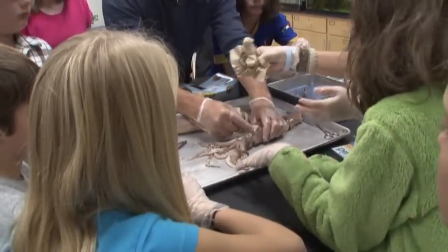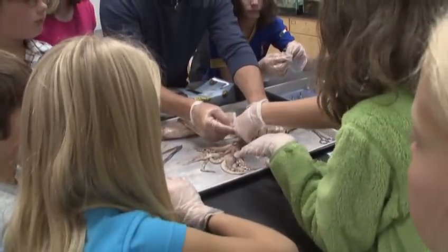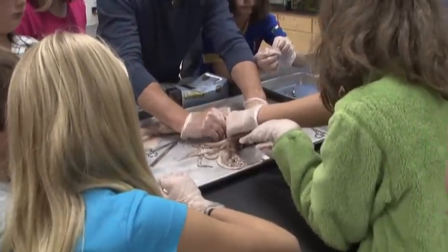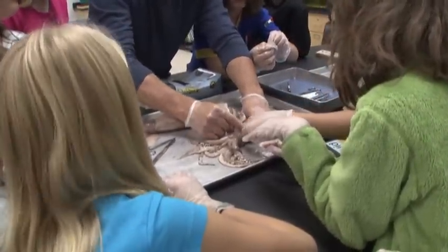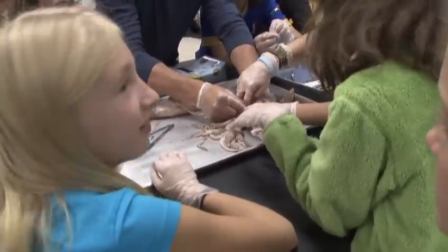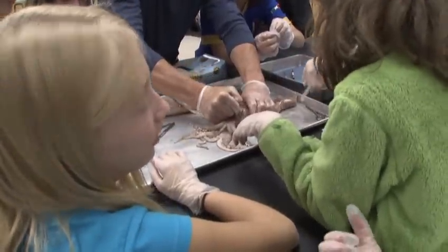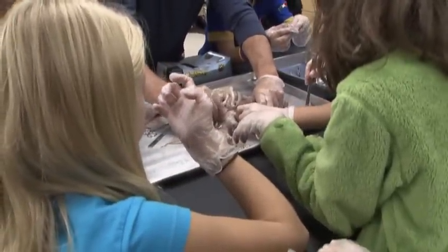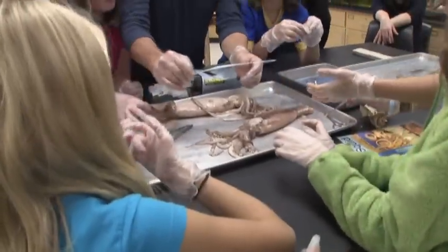Can you grab it? When did you have any fear of dissecting animals at some point? No. Really? You just got in there with a knife and hacked? No, you don't hack. You learn in lab how to do it, after years of schooling. Did you get it? I think I got it. Ooh. There. Yeah. There's the pen.